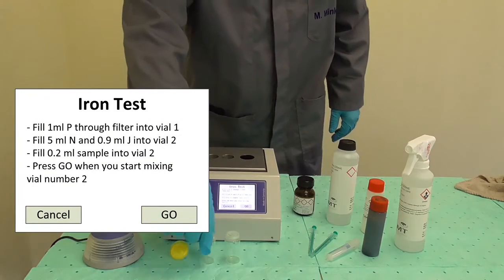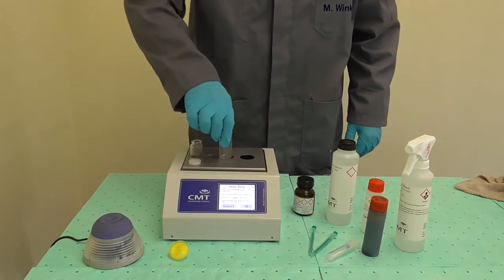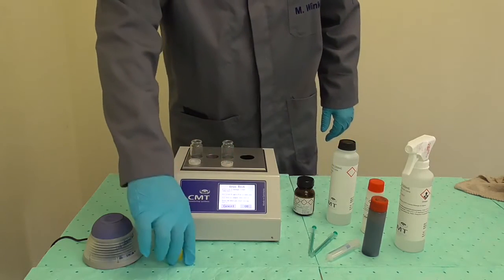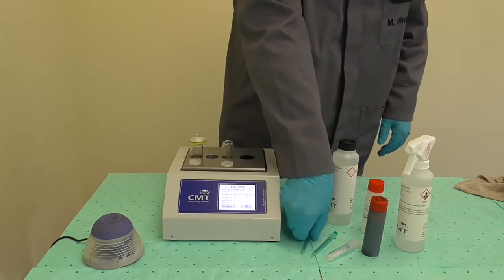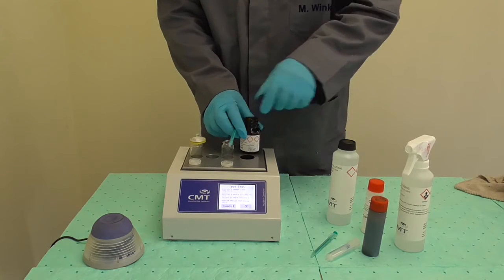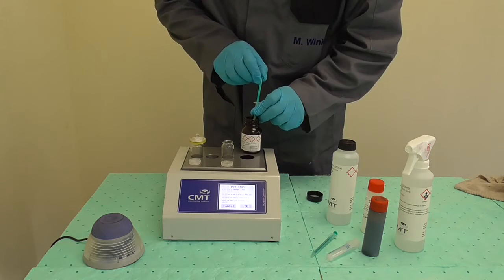Uncap two glass vials and place them in two of the three holes on top of the unit. On the first vial placed on the device, put a yellow filter. Open the bottle of reagent P and use a one milliliter syringe to extract a full syringe of reagent, pulling the plunger up to the end.